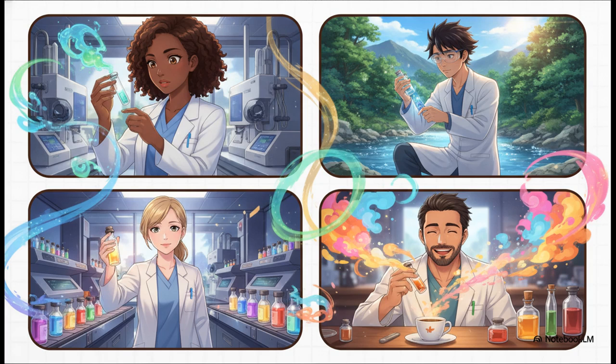In environmental analysis, we use it to track down dangerous pollutants in drinking water or pesticides in soil. Clinical and pharmaceutical labs use it for rigorous quality control. Heck, food scientists even rely on it for aroma analysis, characterizing the exact flavor profiles in your favorite beverages and essential oils. It is literally everywhere.